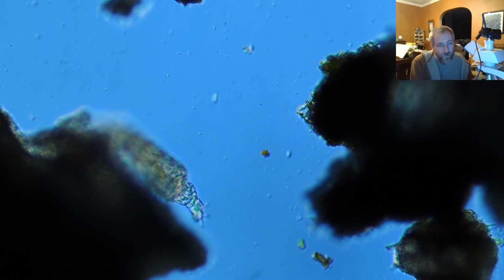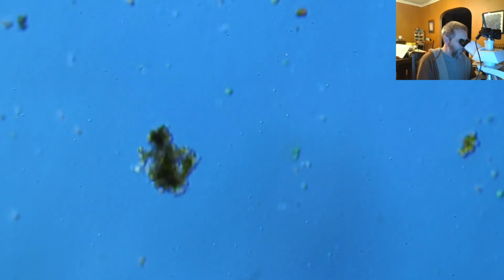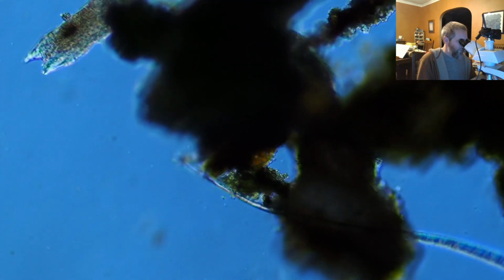Nothing wants to sit still, of course, in these settings. But yeah, I think that's how they tell them apart for the most part. It's basically body form, mouth parts, shape of the body, size, and coloration. So I'm sure there's a bunch of characteristics if you're an expert, such that they seem really different to you, whereas to us they probably all look very similar.